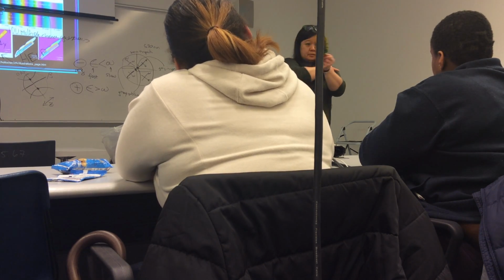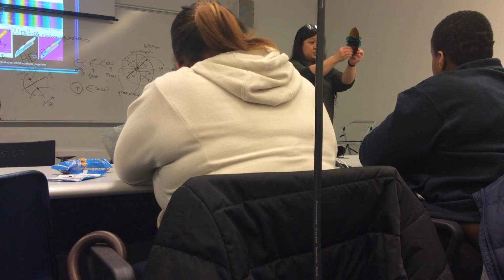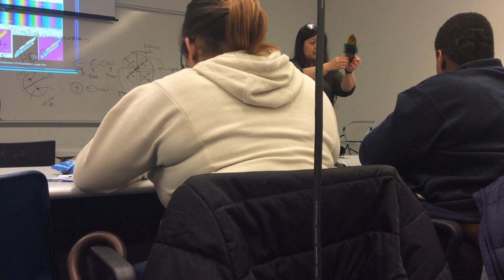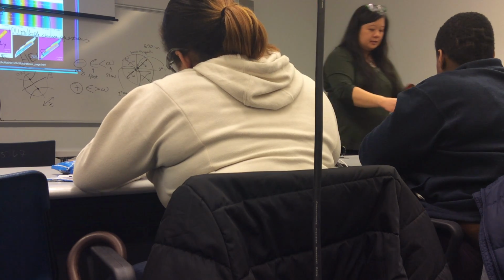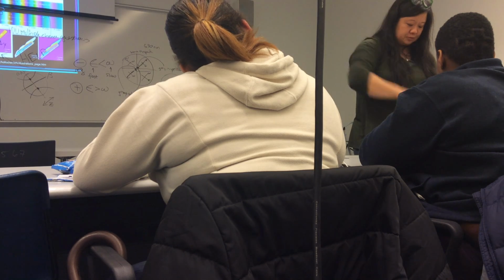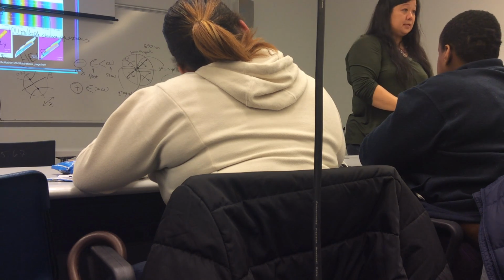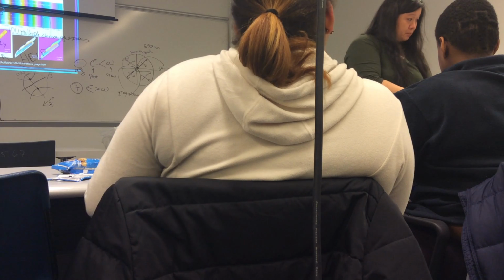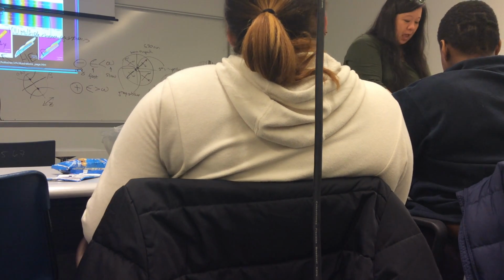So when you're looking at this, it's positioned on the microscope. If the acute bisectrix is aligned with the light path of the microscope, then it's on the stage of the microscope like this. The optic axes are coming out, and those will be the melatopes that I see in a conoscopic image. Basically the center of the brush will be the melatope.